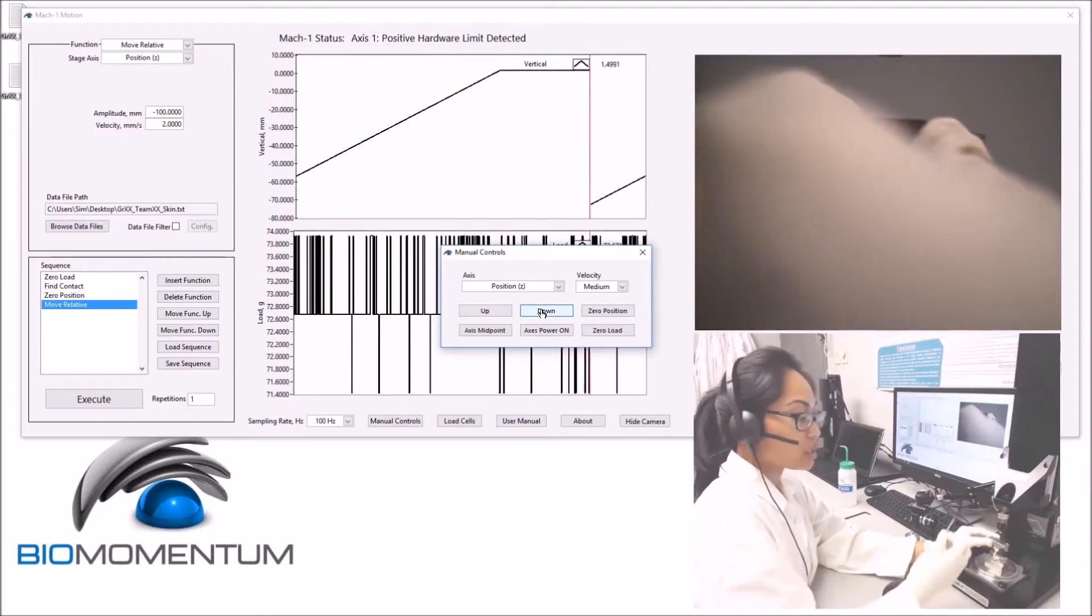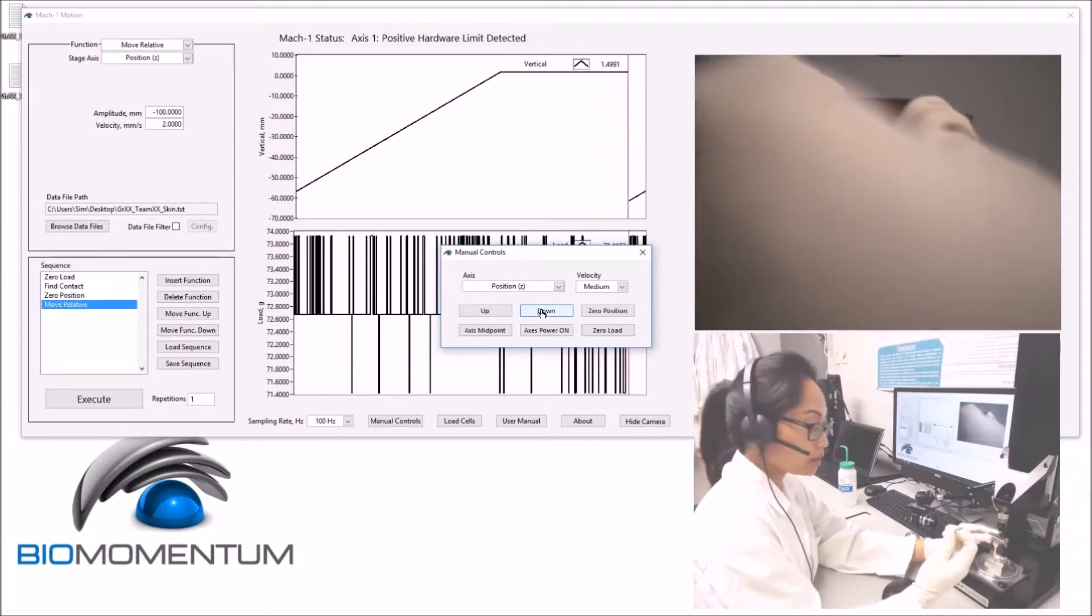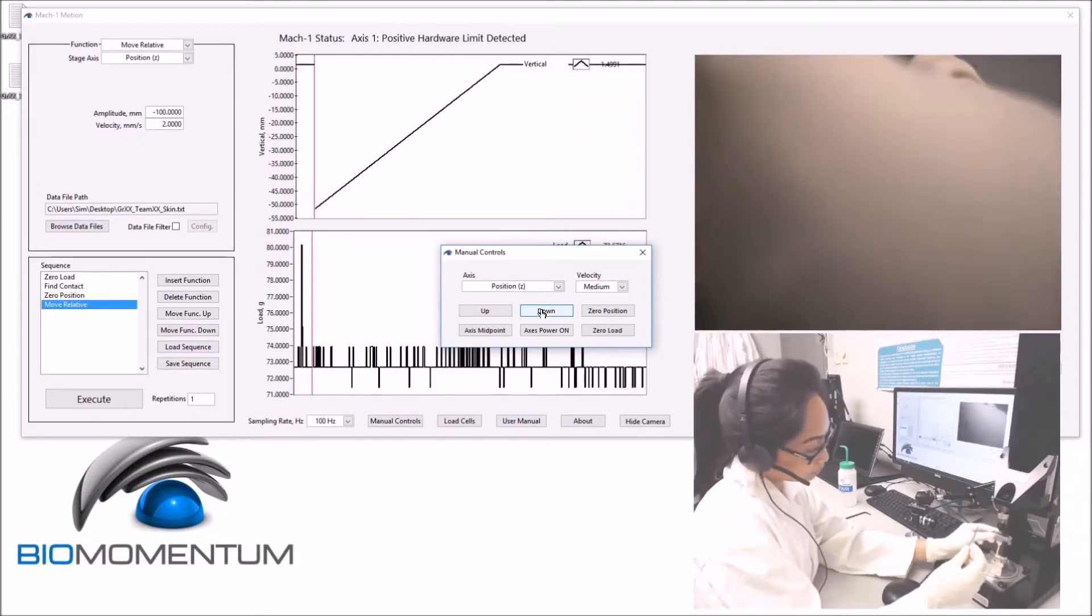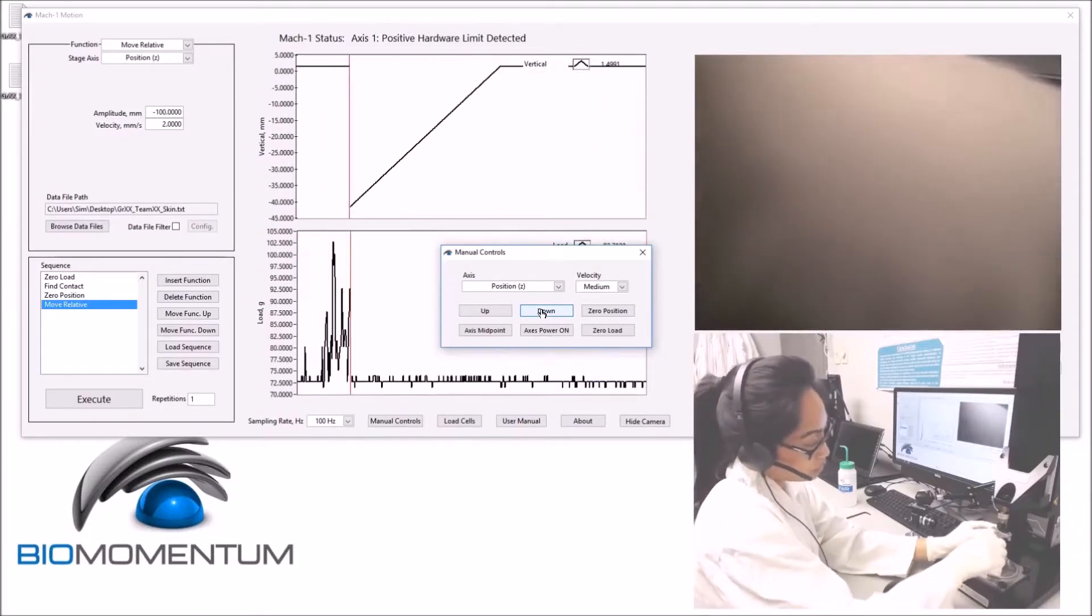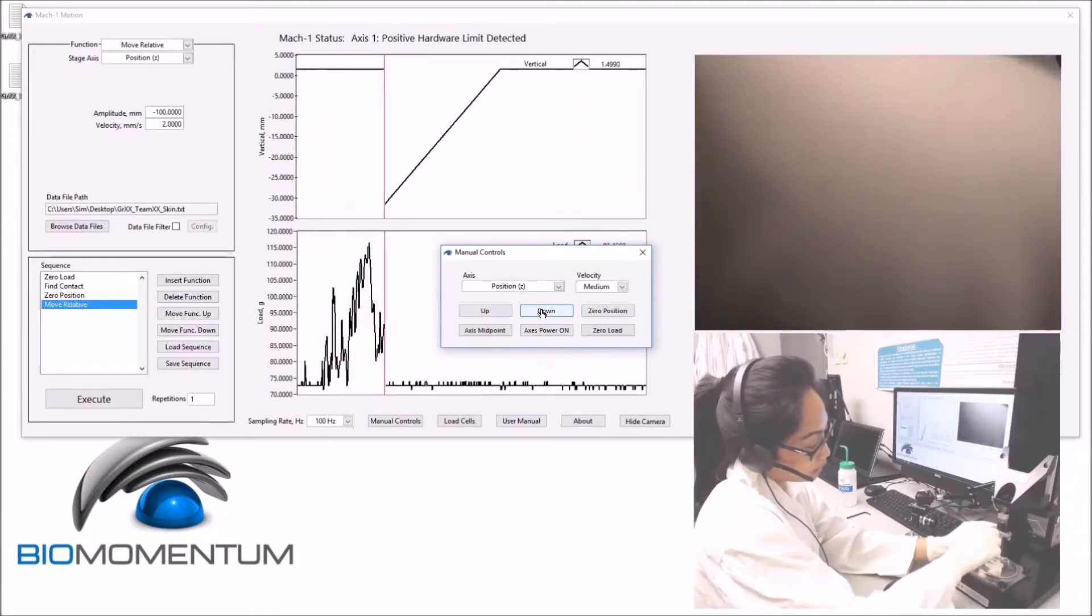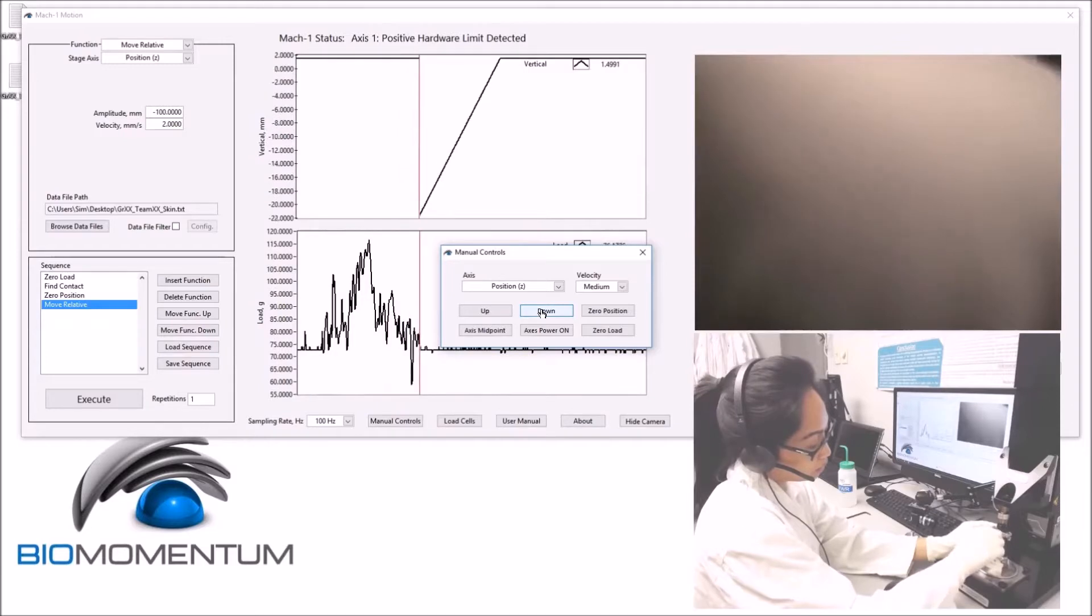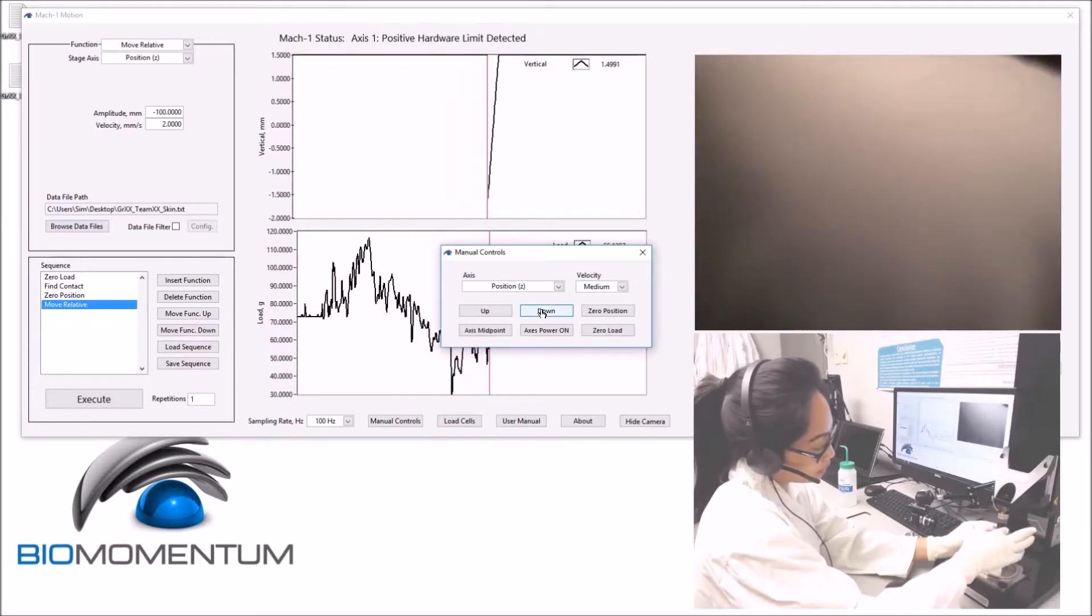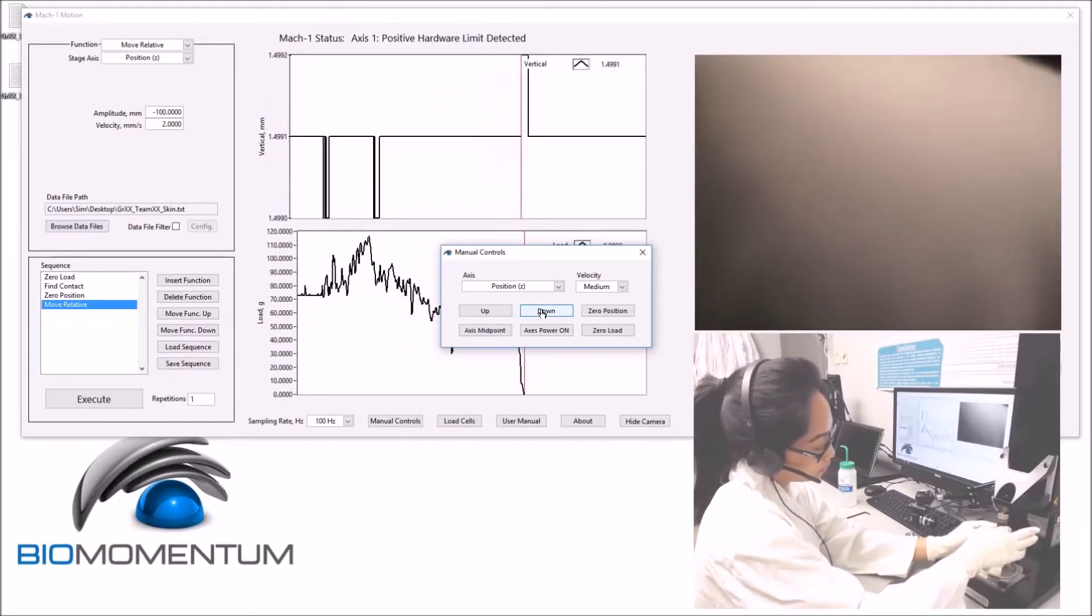Using the fixation pin, insert the pin in order to secure the tensile grip to the sample holder.